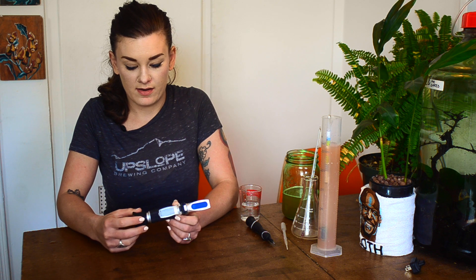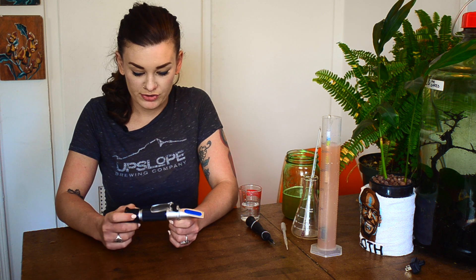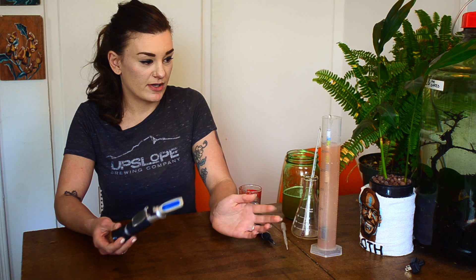Refractometers are very neat. They were basically developed to measure the sugar in fruit juice. It's kind of the same idea as the hydrometer — it measures sugar and it's not quite as accurate, but you only need about three drops versus 250 milliliters for a hydrometer.